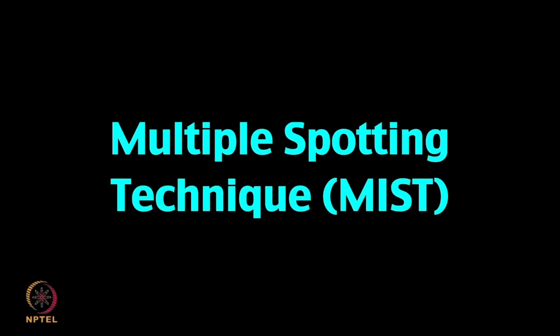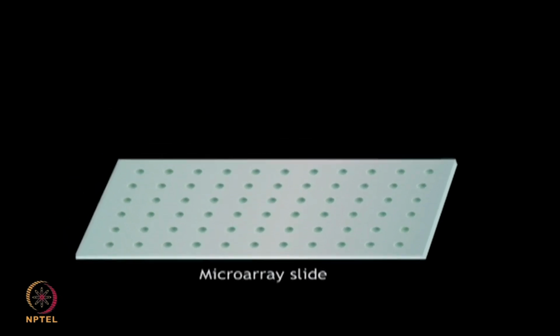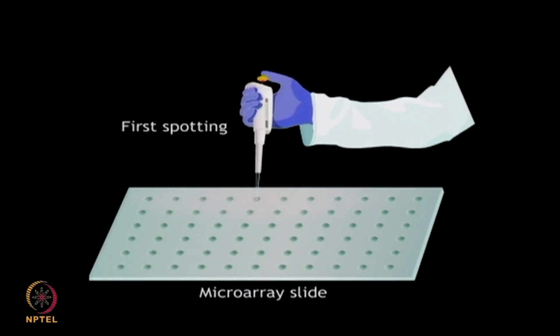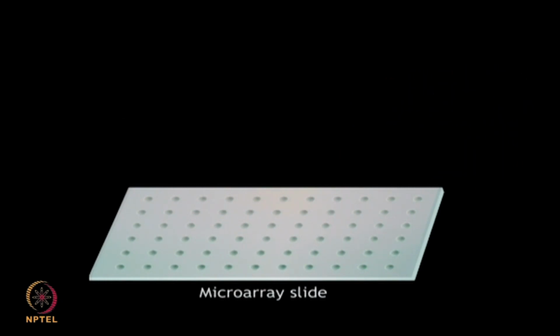Let us now discuss the working principle of MIST by showing this animation. Multiple spotting technique or MIST. In this technique, the first spotting step of the multiple spotting is capable of producing high density arrays.